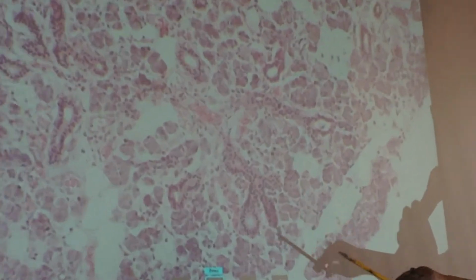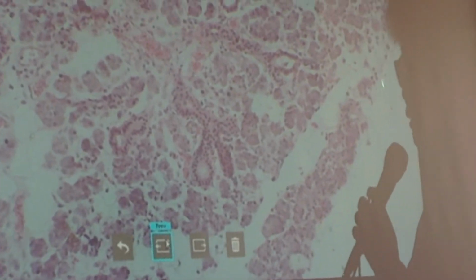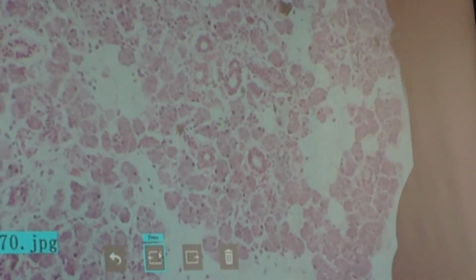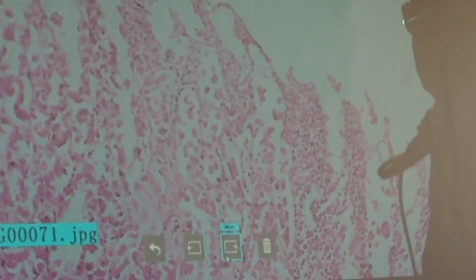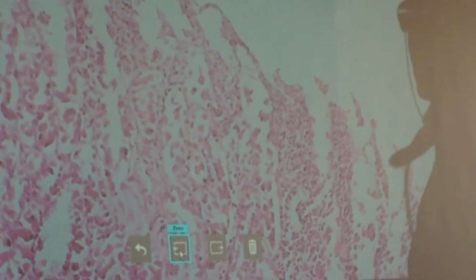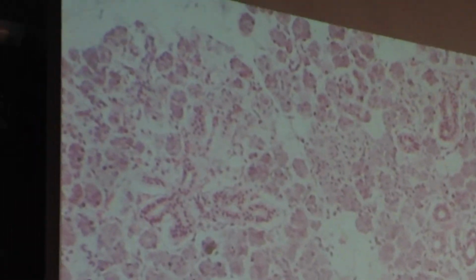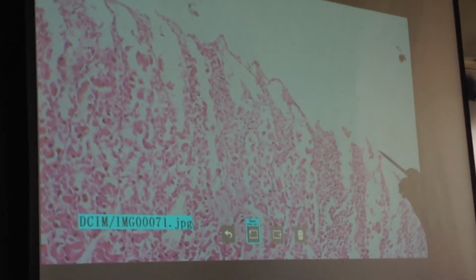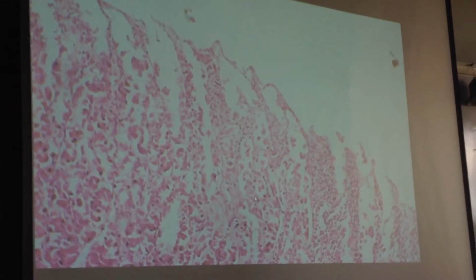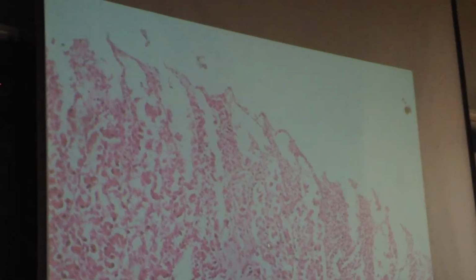You have there a lot of serous acini, and these are your ducts, and there your intralobular duct. I will just show later the serous demilunes. So those are the three salivary glands. Okay, let's proceed to the superficial.